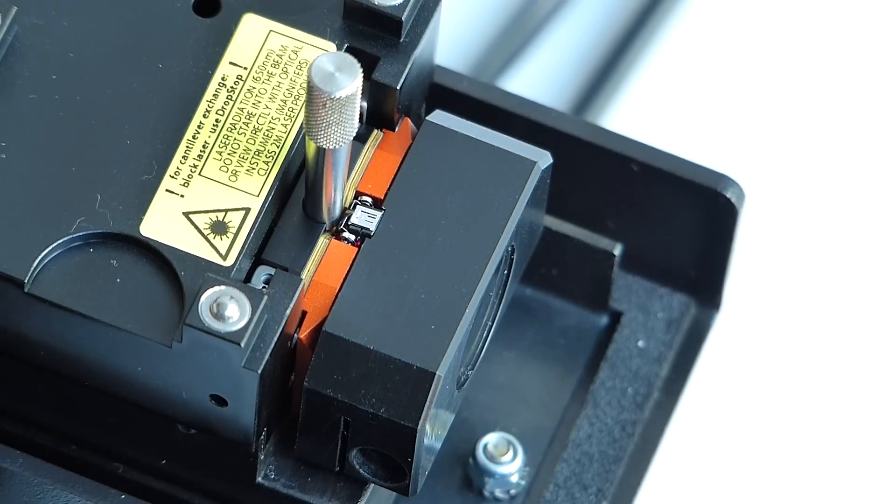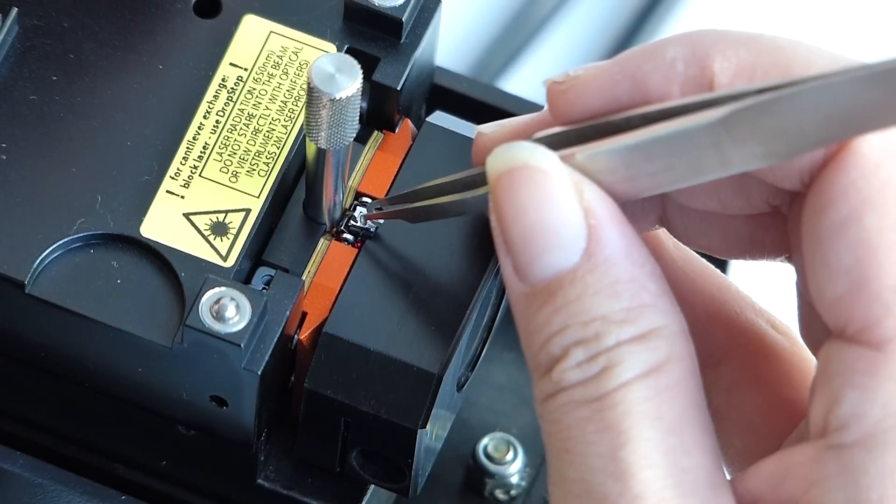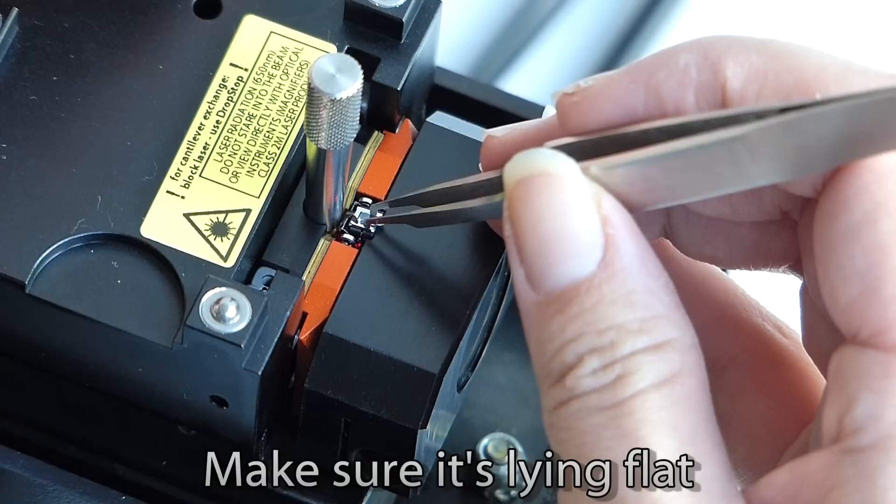The new probe is now placed onto the alignment chip. Note that the edges are beveled, so that even if the probe is not dropped exactly in position, a small nudge will ease it into place without fuss.